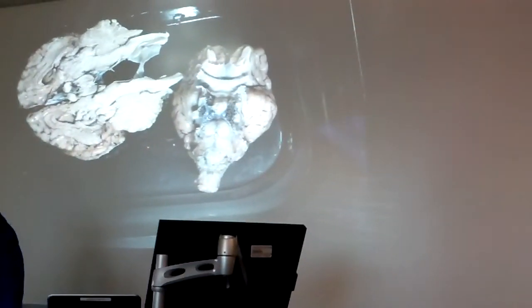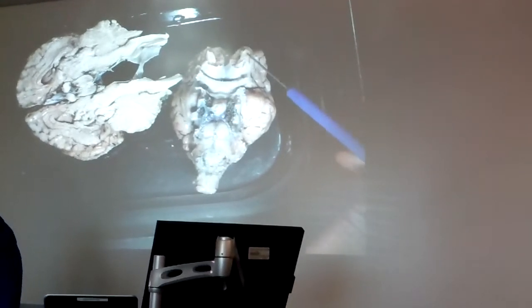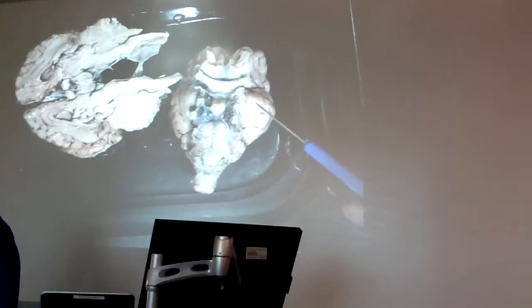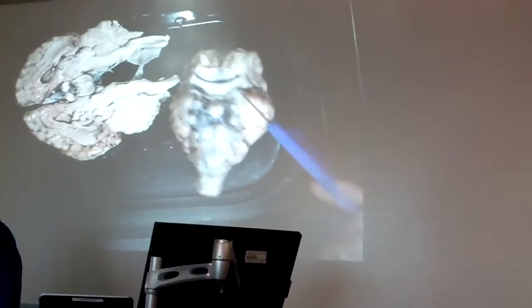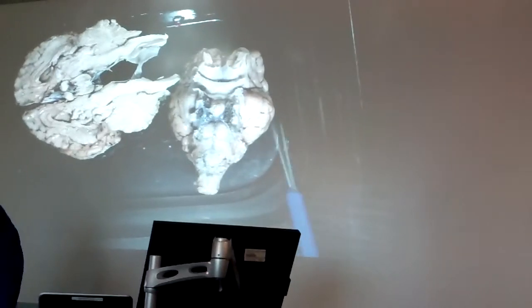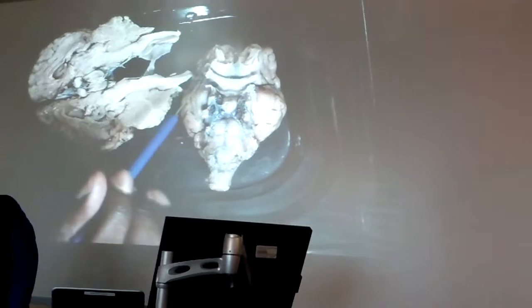So, Mr. Gilmore, hold on, do that again. This is the olfactory bulb that has the olfactory nerves extended from it. Those olfactory nerves go through the cribriform plate of the ethmoid bone. If that much is true, Mr. Gilmore, what's this cute little structure that's going to the side? Well, that's the olfactory tract. That's the olfactory tract that's coming to the side.